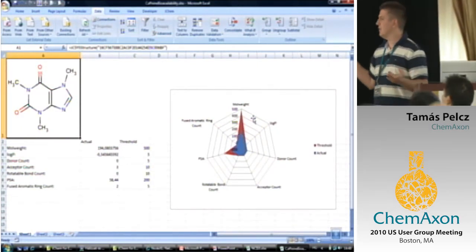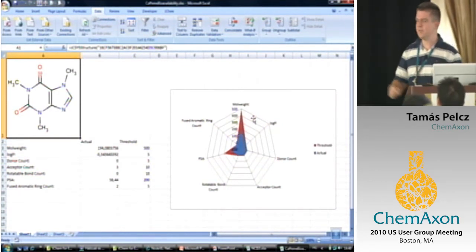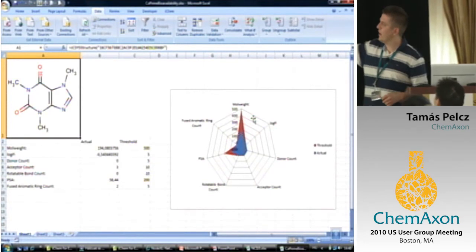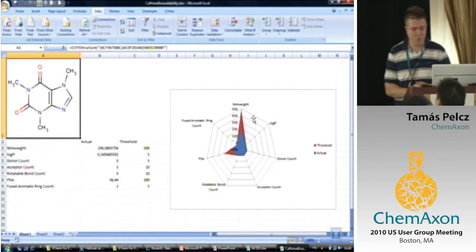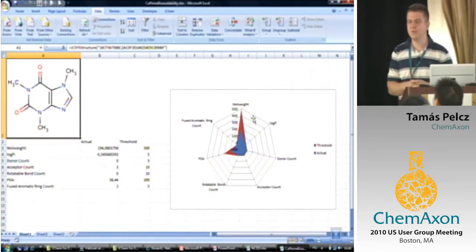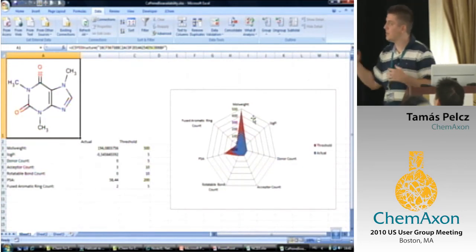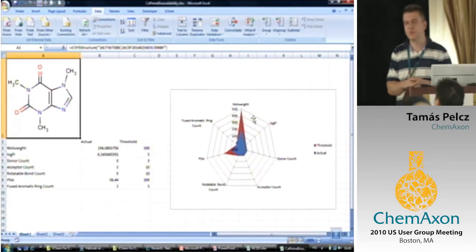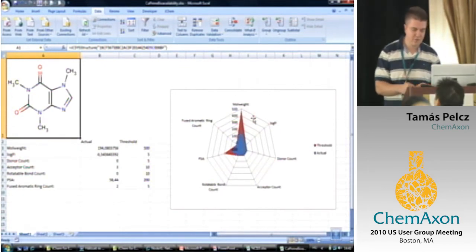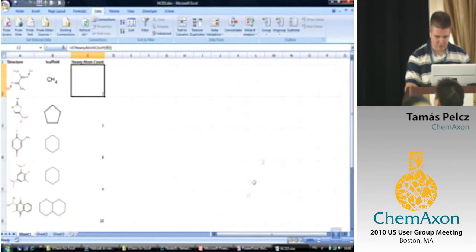What is not really good with the built-in Excel radar chart is that it's not possible to define the scale range of the various axes of the radar chart. So we will have a look at the new Excel version, and if it still does not support it, maybe we'll also look at including some other third-party charts as well. So I'm going to close the tab.